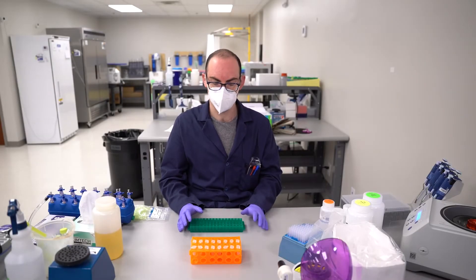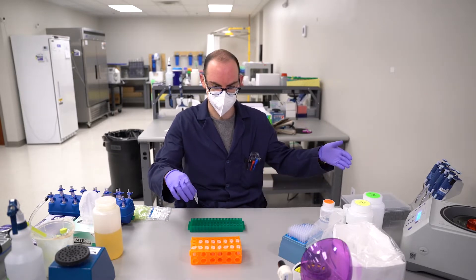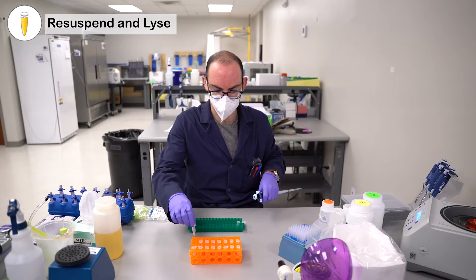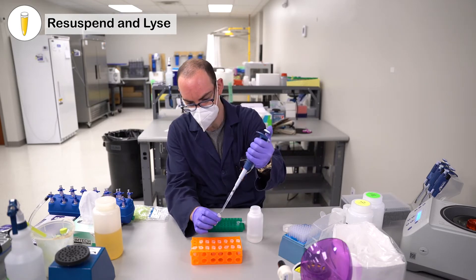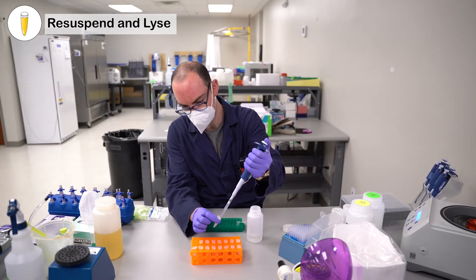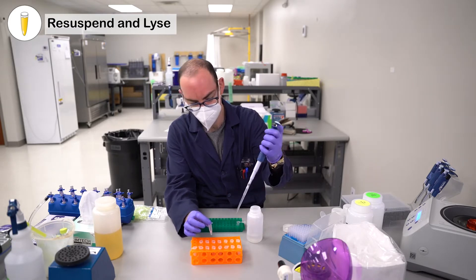To start this protocol, you need a bacterial pellet and all of the things provided in the kit. You start with your bacterial pellet and re-suspend it with Solution 1. Put in 175 microliters of Solution 1 with the bacterial pellet, then pipette mix it until it becomes a homogeneous solution.